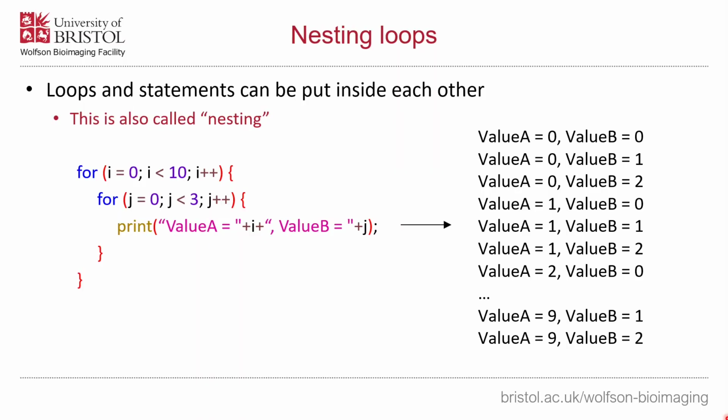Now, just before we finish with if statements, conditional statements, loops, and all of that, I just want to introduce the idea of nesting these. So far we've progressed from having a series of operations which we execute in a linear manner to introducing the idea of conditional statements and loops we've just done. But you can also mix and match these even further. So you could have a conditional statement within a loop. In fact, you'll see this later on.